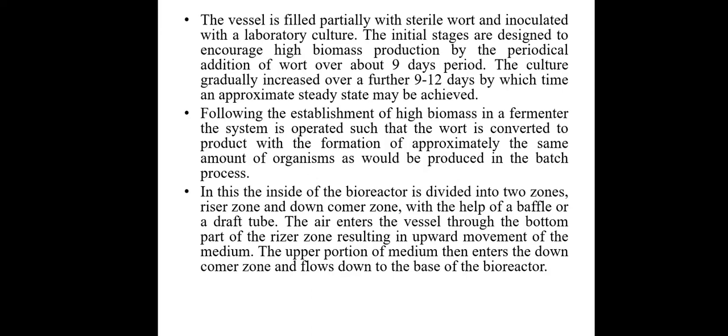Following the establishment of high biomass within the fermenter, the system is operated such that the wort is converted to the product with the formation of approximately the same amount of organism. Along with the product formation, there is also formation of microbial biomass.